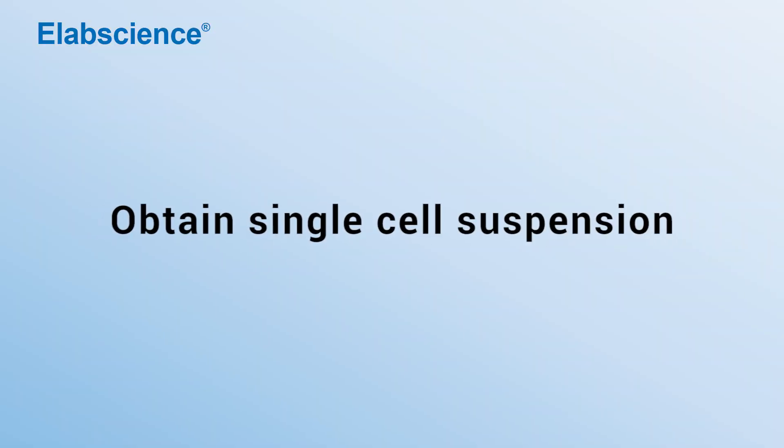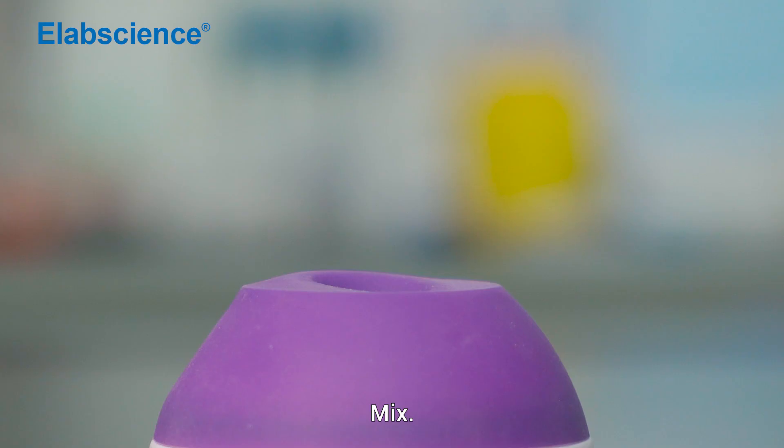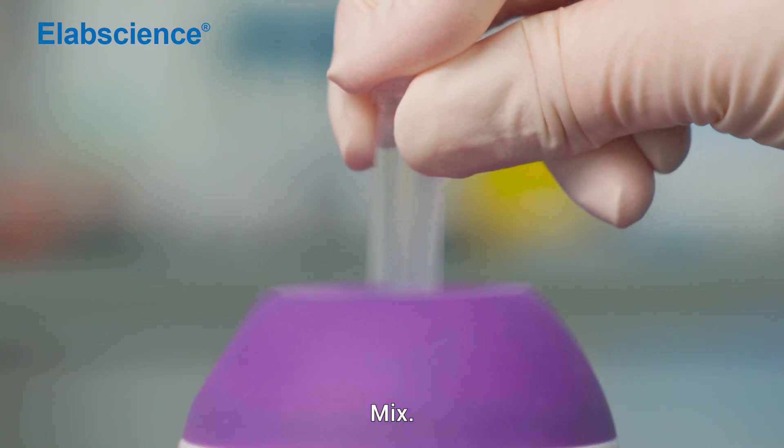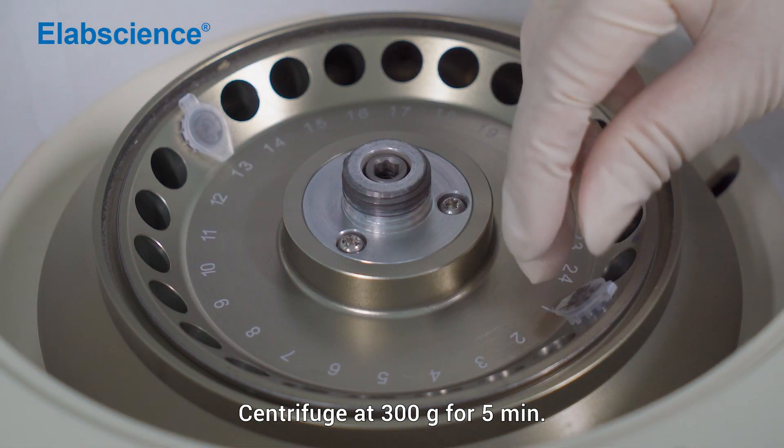Obtain single-cell suspension. Wash once with 2 ml of PBS. Mix. Centrifuge at 300 times gravity for 5 minutes.